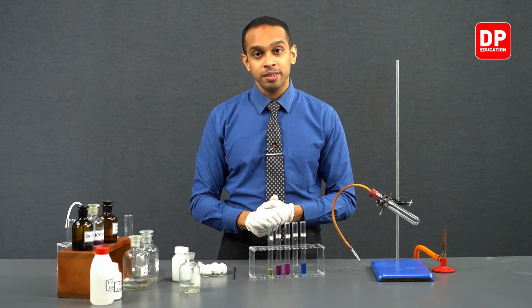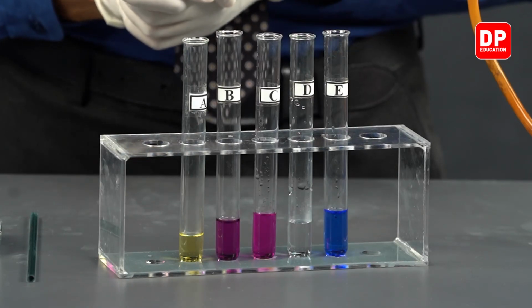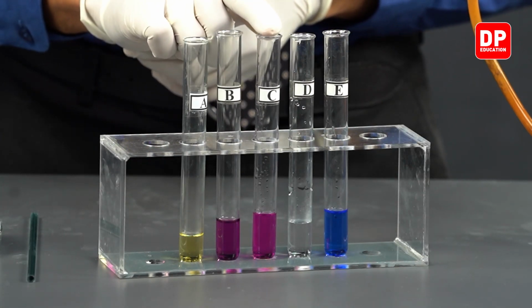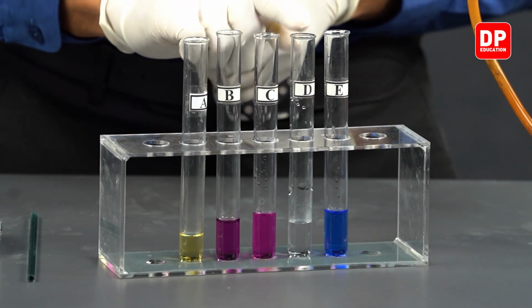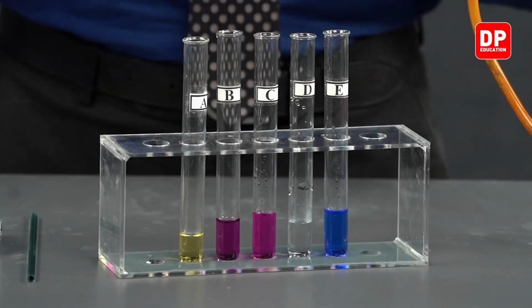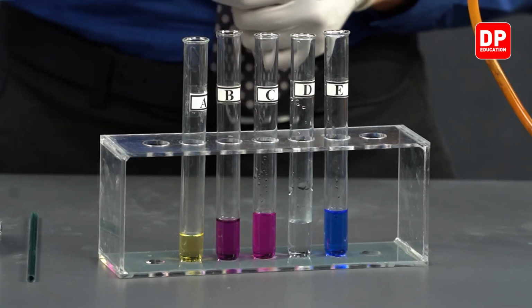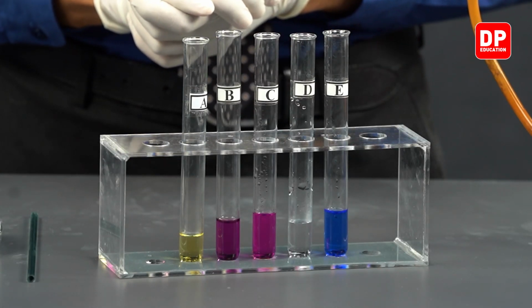And then we have in test tube B, dilute alkaline potassium permanganate. In our test tube C, we have acidified potassium permanganate. In our test tube D, we have ammoniacal silver nitrate, or in other words, Tollens' reagent. And in the test tube E, we have ammoniacal cuprous chloride.